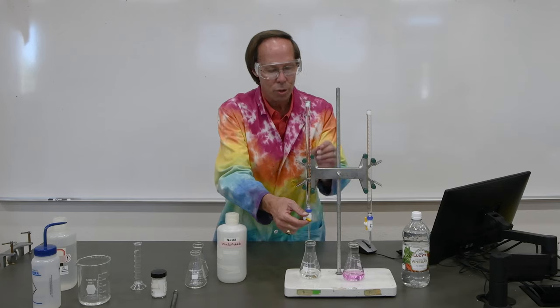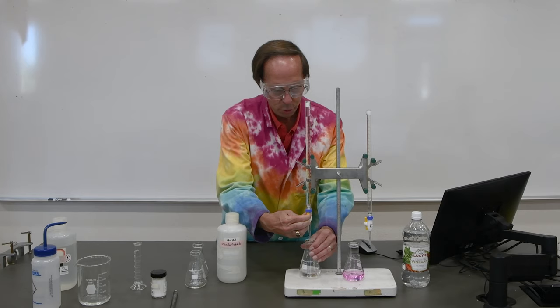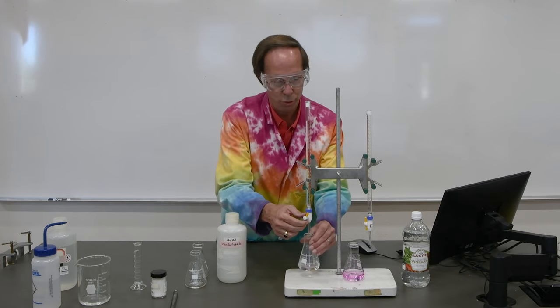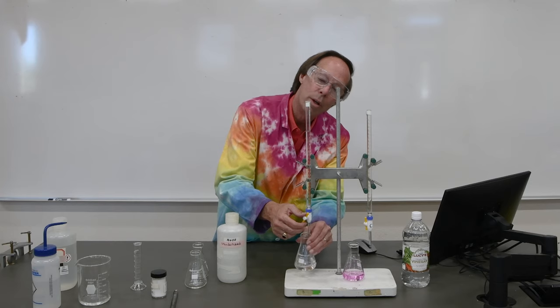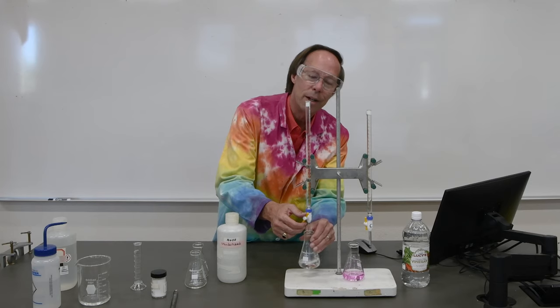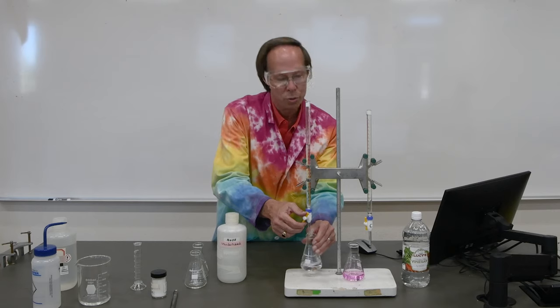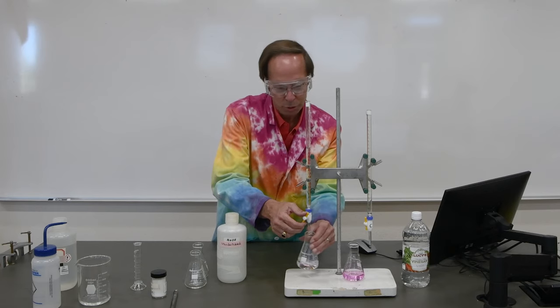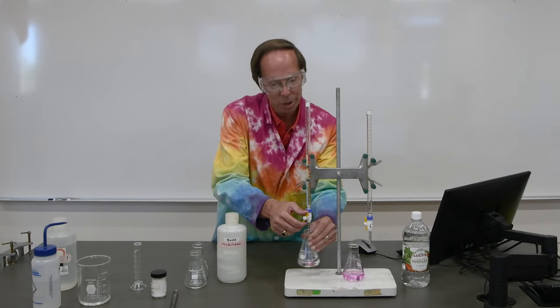So let's start out here. We're right at the zero mark. We'll go ahead and add it fairly quickly to start with and continue to swirl it. So there's 1, 2, 3, 4, 5, 6. We're getting there. We'll take it down to about 12 again or so, and then we'll start doing it one drop at a time just to make sure we don't overshoot. You might see the little flashes of pink in there, but they're not persisting because we're not quite to the end point yet.